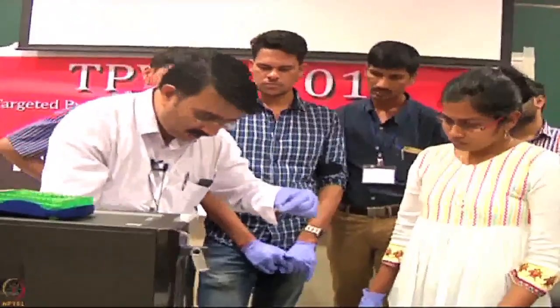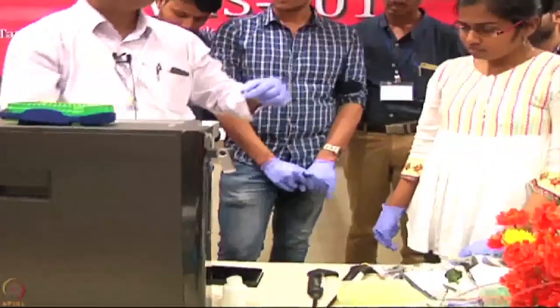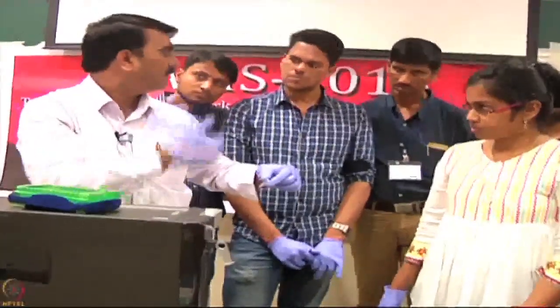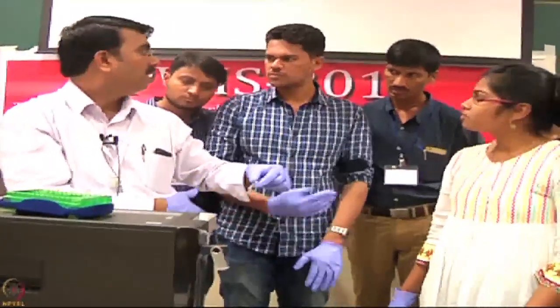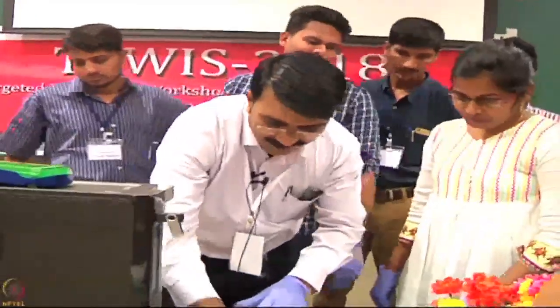So transfer 300 here, and to the rest of the wells you add buffer, and then do a serial dilution. Take 100 microliter, transfer, and thoroughly mix it. Then take 100, then mix it. Or otherwise I will do it, not a problem here.